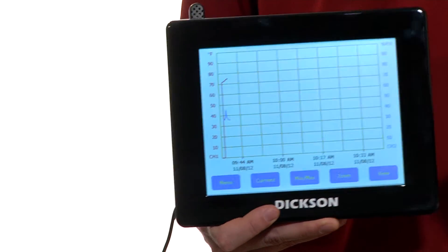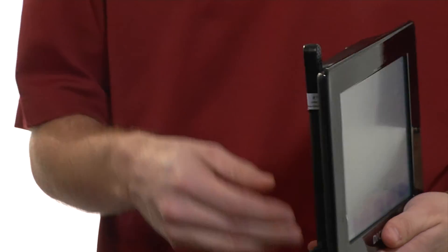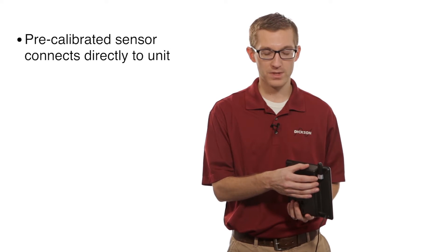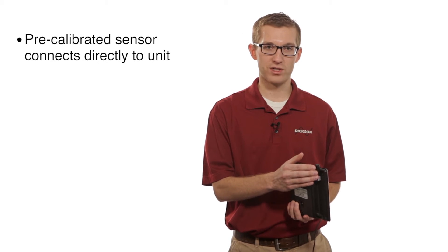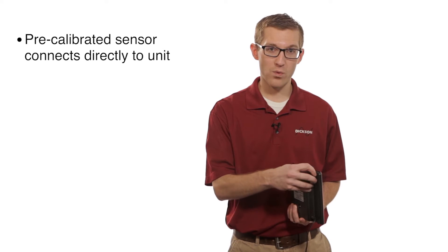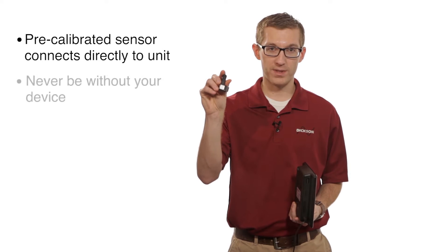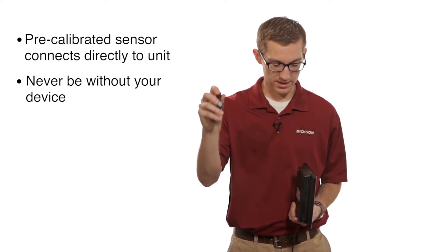A couple of cool features about this unit are the actual sensor itself. It is a precalibrated sensor. As you can see, it's connected directly to the back of the unit. All the calibration information is stored on the probe, so when it's time for you to recalibrate, all you have to do is buy one of our PCSs or our precalibrated sensors.